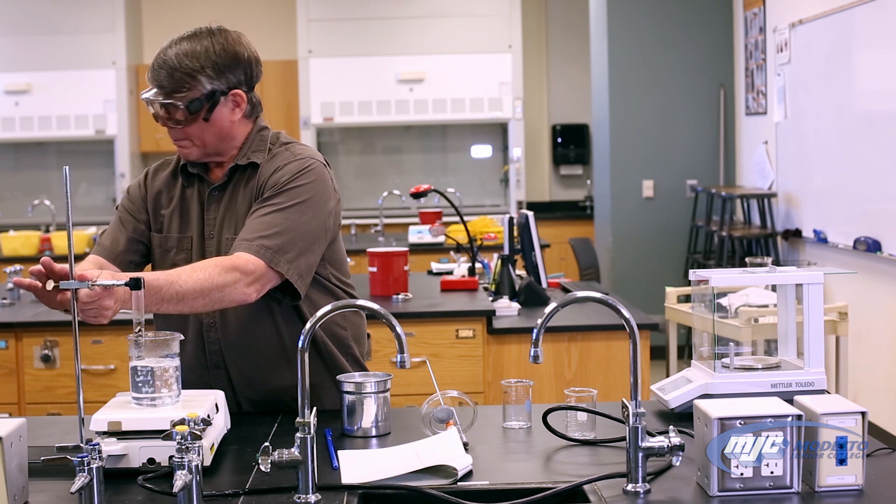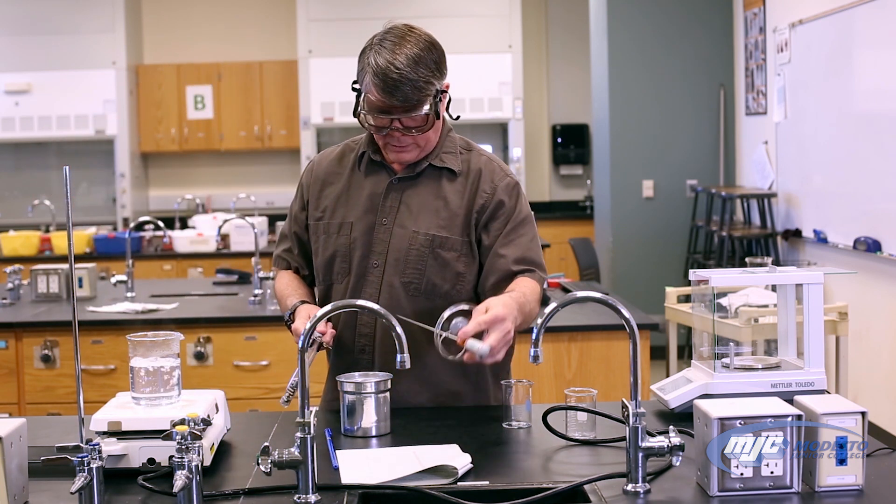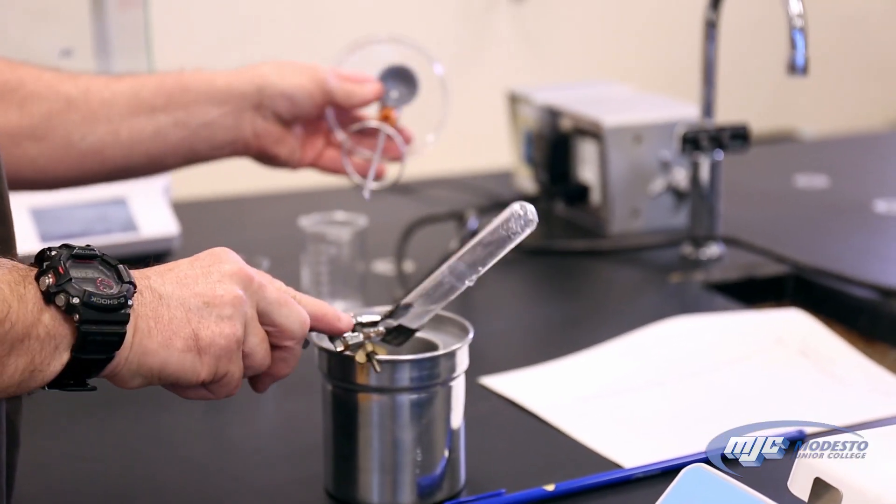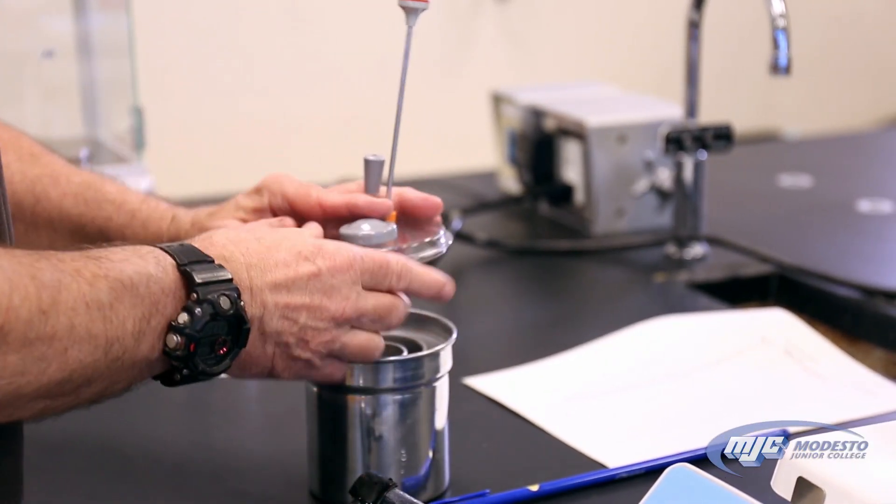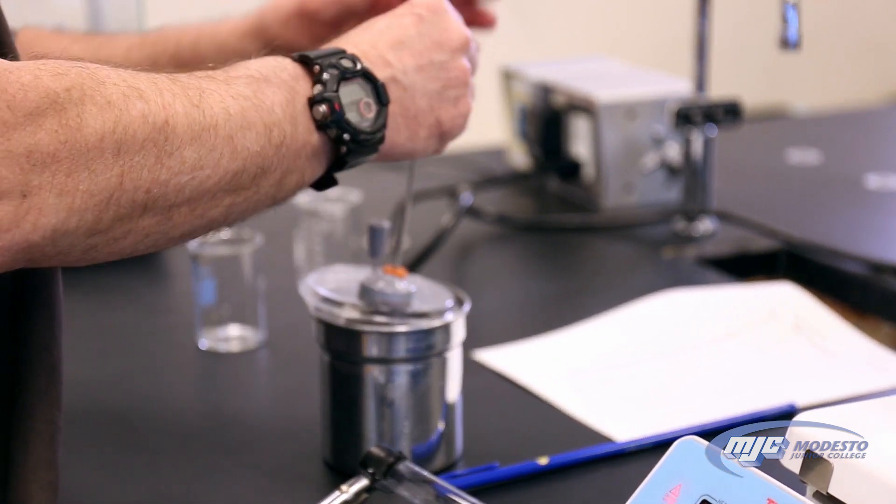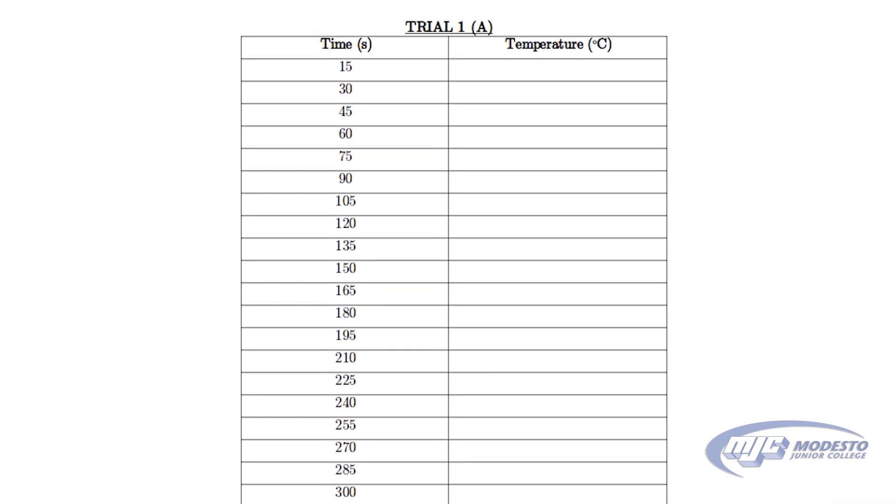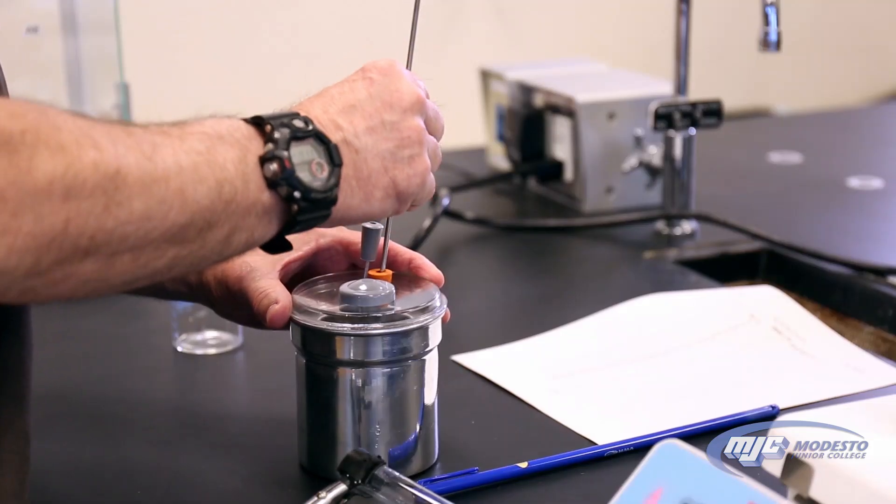Undo the clamp here. It's not hot back here. Up here, it's going to be really hot. So what we do is we take this, dump it in to there, put this in, start agitating, and then every 15 seconds we record the temperature in our table. Go all the way through.